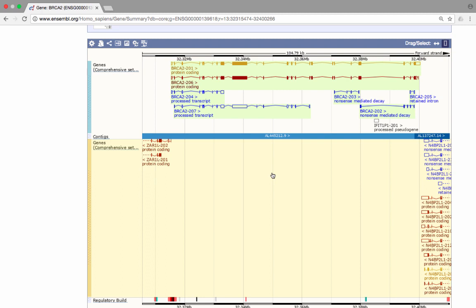Let's choose one of these transcripts to explore further. We could either click on one of the transcript IDs from the table above, or click on the transcript diagram and follow the link to the ENST identifier. I'll choose the golden transcript.